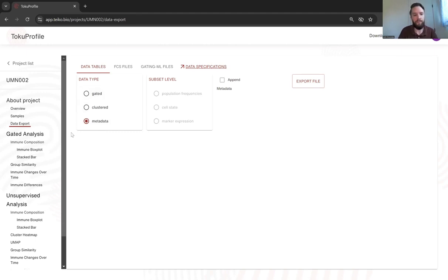So this concludes the base section of the features. This is what you get. This is basically, you get the results of our gating, and we can answer any questions you might have about that in our collaboration, but this is basically what you receive with a base tier project.